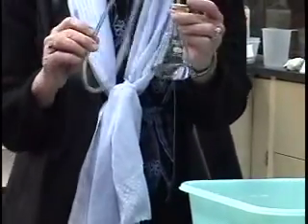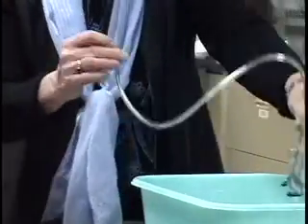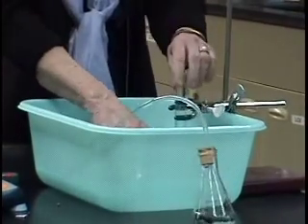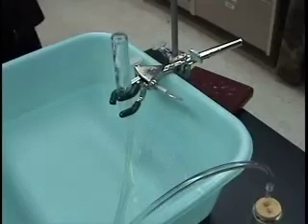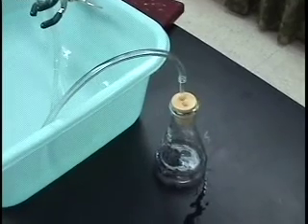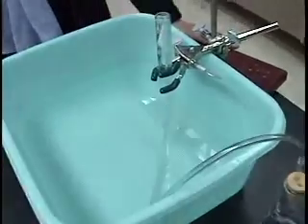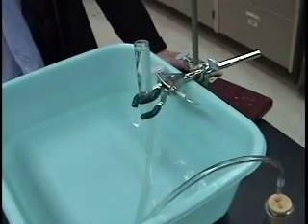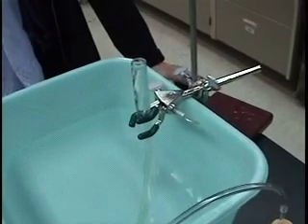The students will notice right away that quite a bit of bubbling occurs, and they are going to be collecting gas in order to determine the rate of the chemical reaction. To get the air out of the Erlenmeyer flask, we're going to wait about 3 minutes for this to equilibrate before the students will actually start recording the change in volume every minute.